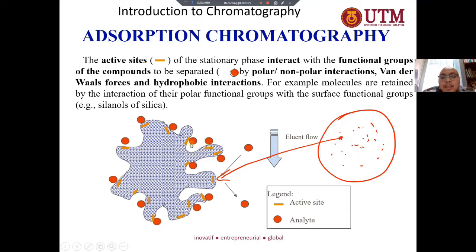If we have a polar active site, the polar analytes will attach, and the non-polar analyte will not interact. If the active site is non-polar, the non-polar analyte will attach greatly compared to the polar analyte. Polar analyte will elute first compared to the non-polar analyte.